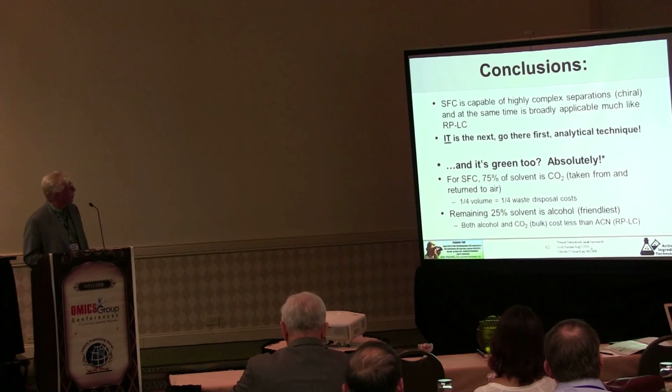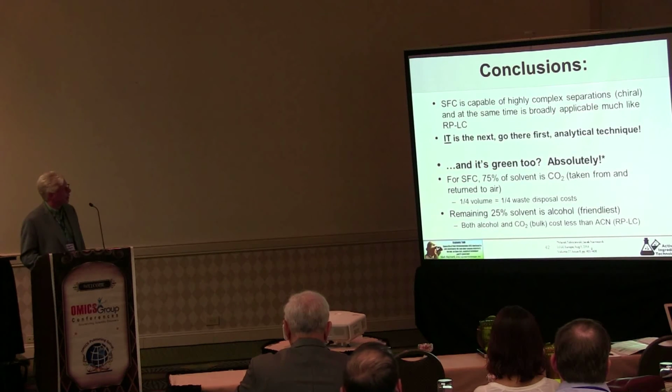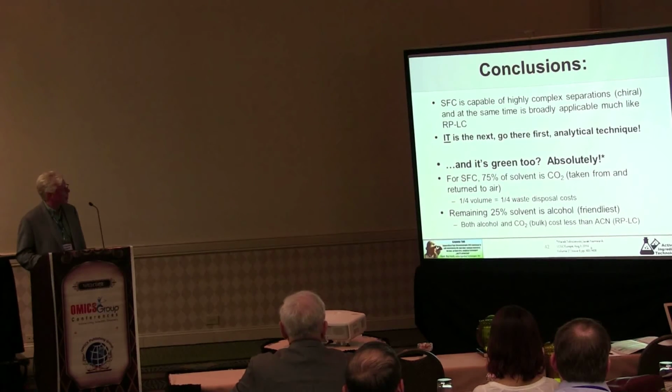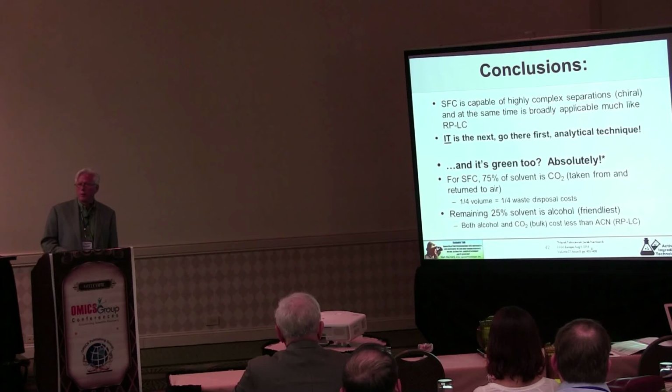The other thing I'd like to point out, it's green. So for SFC, 75% of the solvent use is CO2. We take it out of the air, and then it just is returned to the air. A quarter the volume of waste is a quarter the waste disposal cost. And for us, we do all of our SFC with alcohols, just the first 3 carbon alcohols. So what solvent we have left is probably about the friendliest solvent we can use.